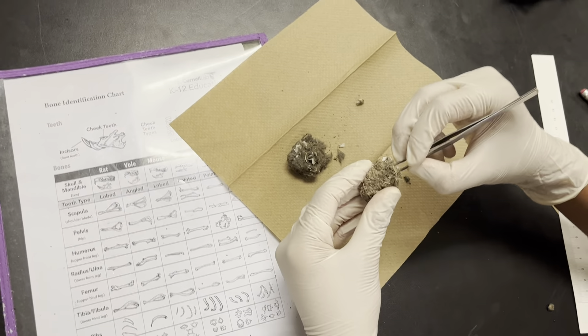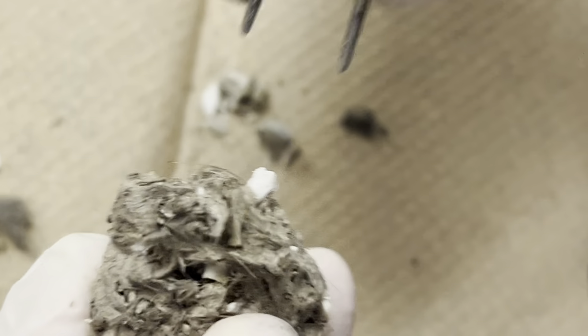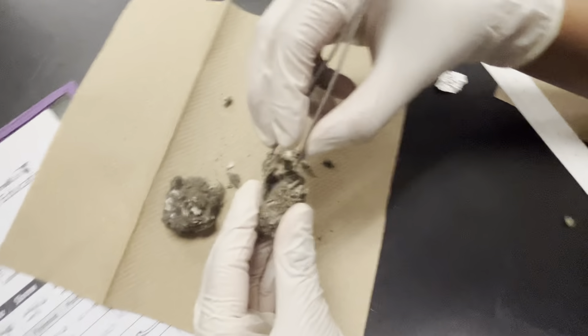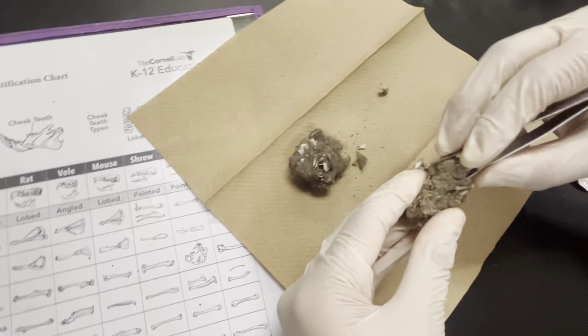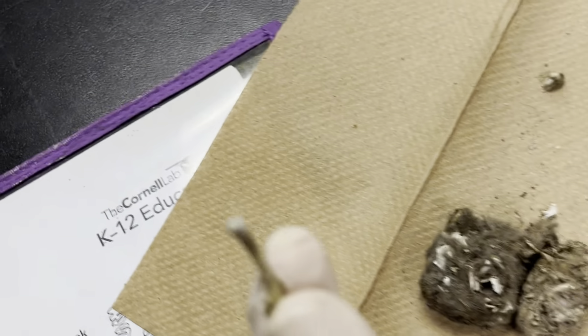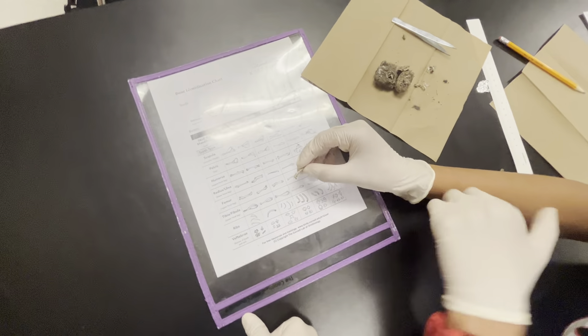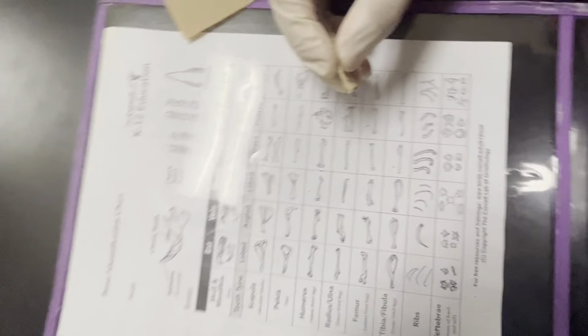Found the bone. I need to cut it open a little bit. Let's see — I think this is a female. Maybe? No, that's not a female. Find something with three.